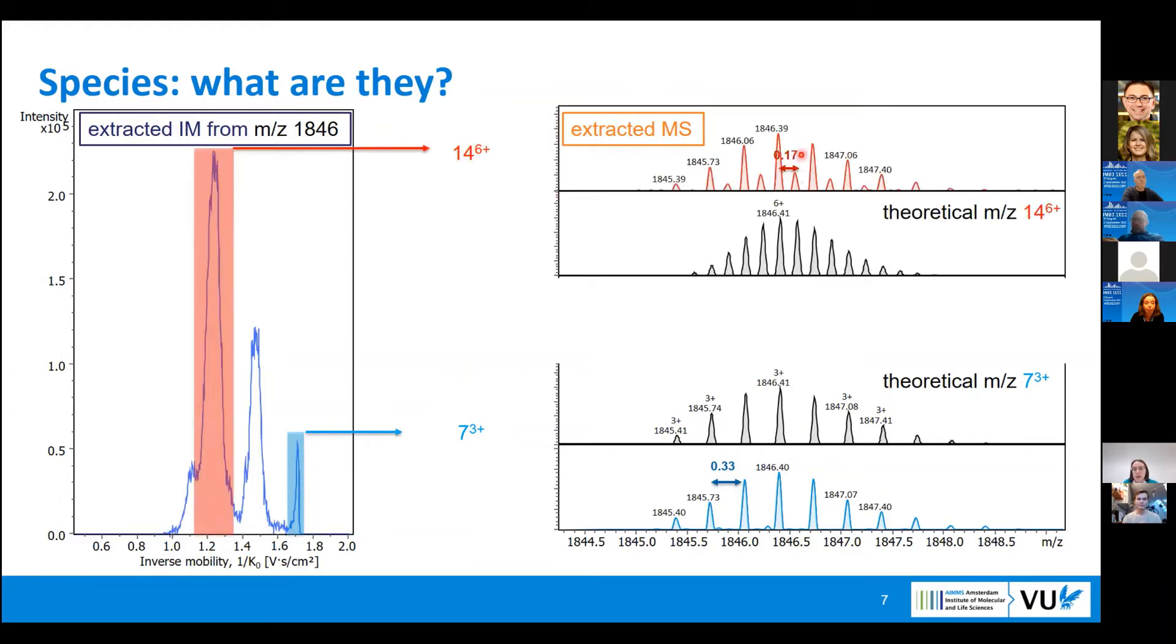The third peak, we do the same, and the distance between the peaks is 6+. So we can assign this to oligomer with 14 monomers at 6+ charge. The peak in the middle has isotopic distribution of both 6+ and 3+, and then probably both of them are present there, but they most likely have different conformations, so more extended to more compact ones.